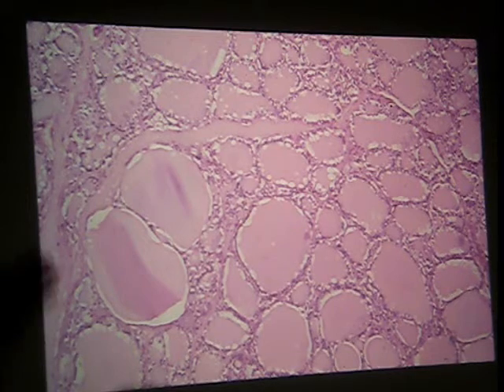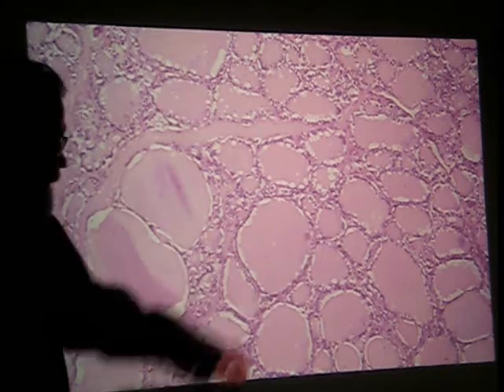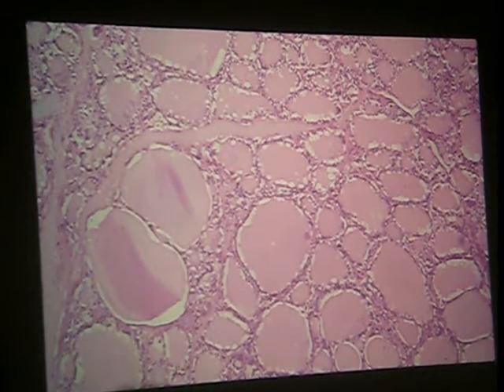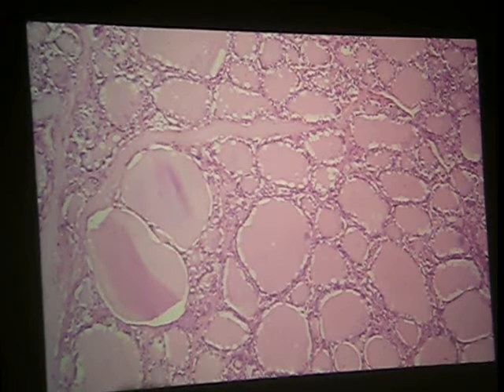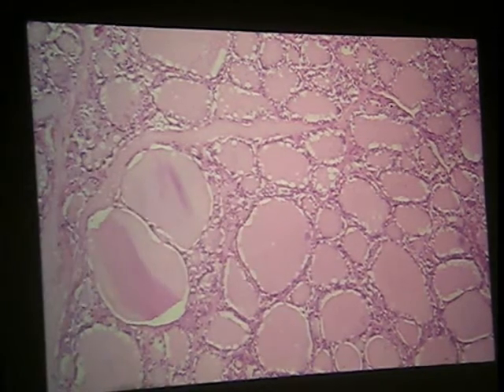Yes, I mean, on your deathbed, you should recognize it. All right? Colloid-filled cysts. Again, what are the hormones that the thyroid gland produces? And? Yes. Calcitonin, from the parafollicular C cells out in the interstitium, T3 and T4 from the actual follicles. Another shot here.